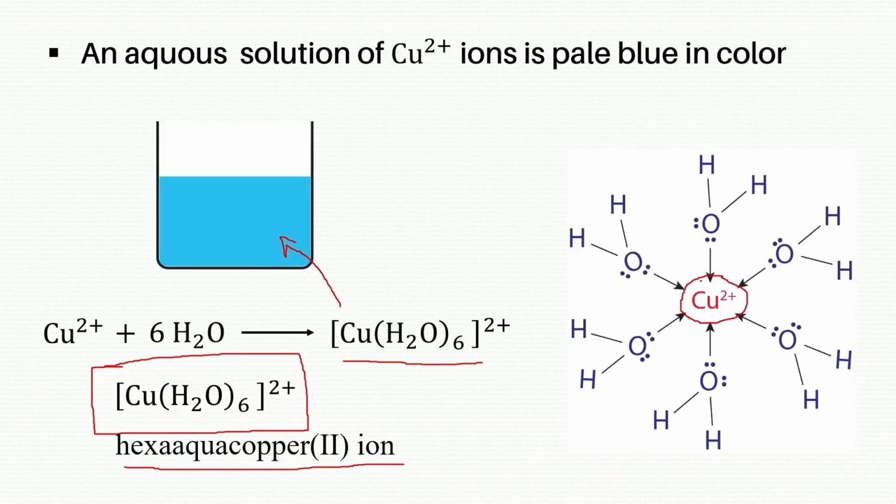It is surrounded by 6 water molecules. Actually, these water molecules are bonded to this Cu2+ ion by dative covalent bonds. These water molecules act here as ligands.